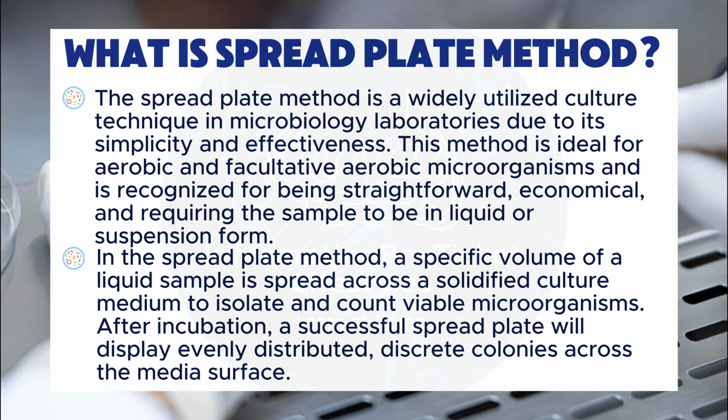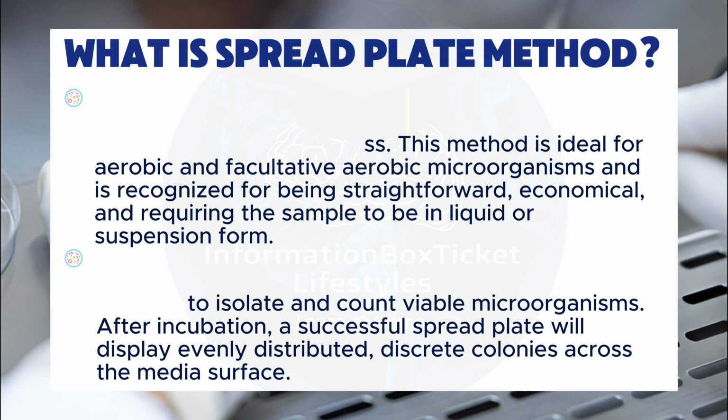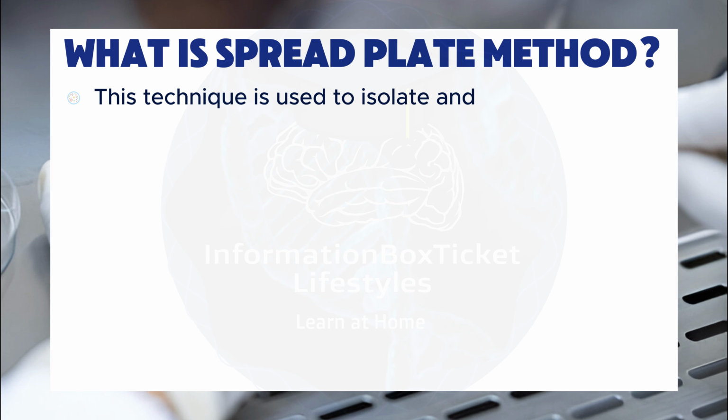After incubation, a successful spread plate will display evenly distributed discrete colonies across the media surface. This technique is used to isolate and count the total number of viable microorganisms, calculating the colony-forming units per ml in the sample. Additionally, it is used for propagating and mass-producing cultures. The method is applicable for all culturable bacteria and fungi.